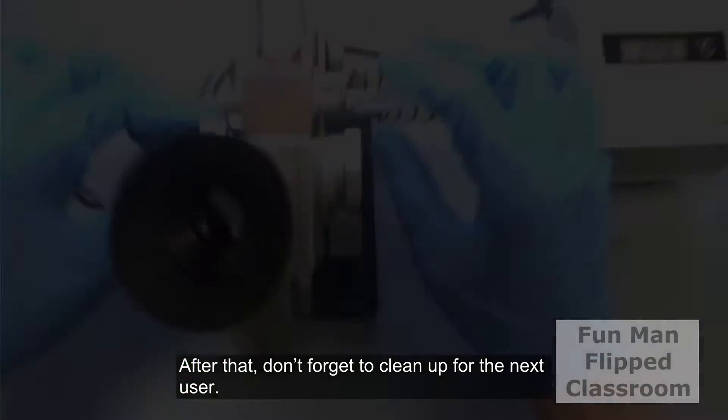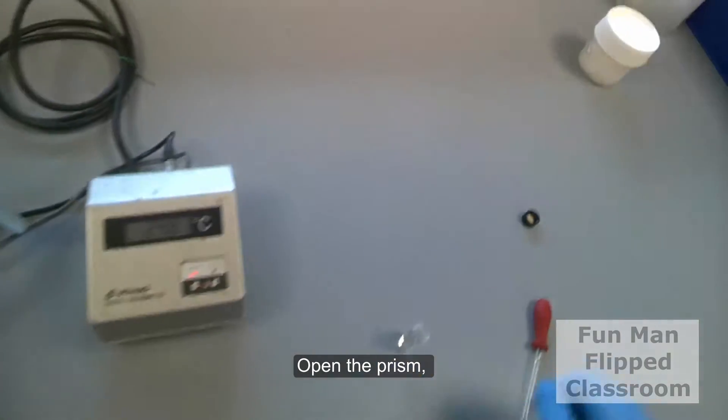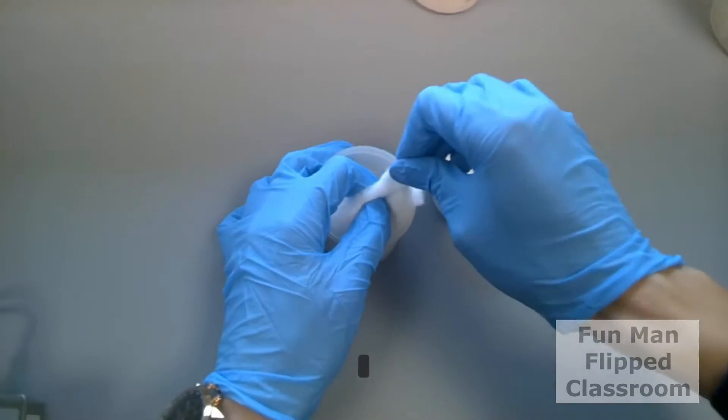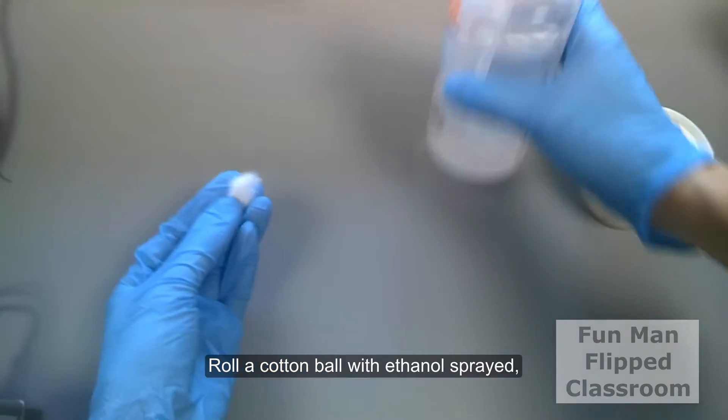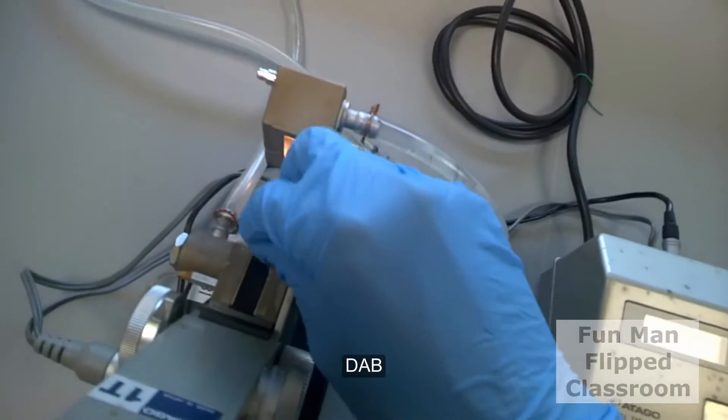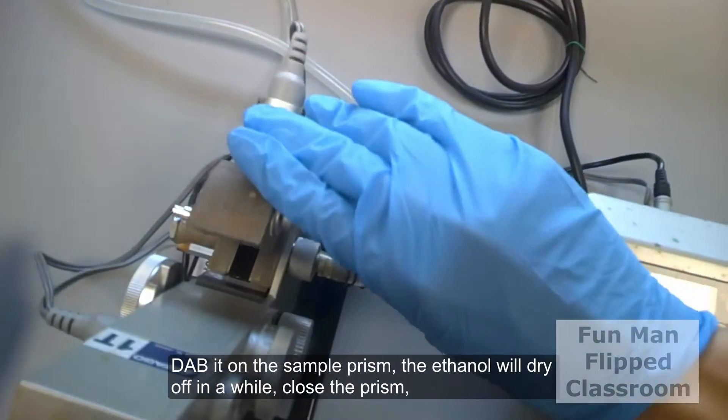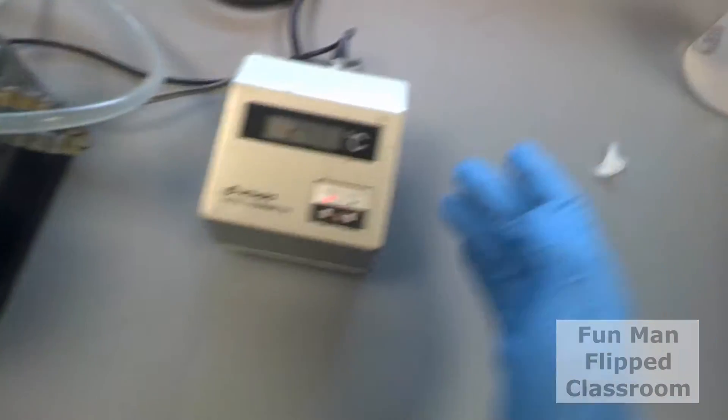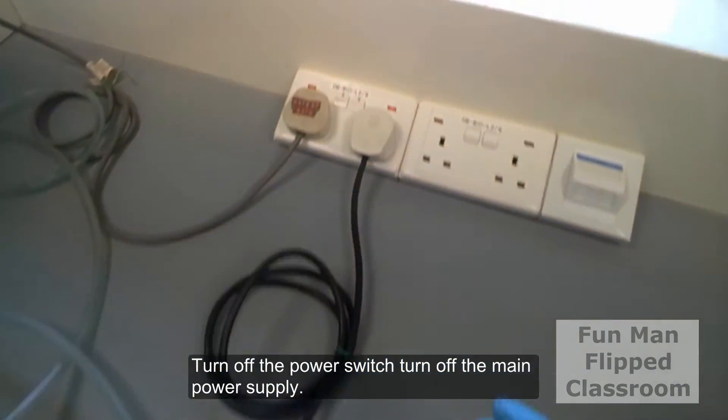After that, don't forget to clean up for the next user. Open the prism. Roll a cotton ball with ethanol spray. Dab it onto the sample prism. The alcohol will dry off in a while, and close the prism. Turn off the power switches and turn off the main power supply.